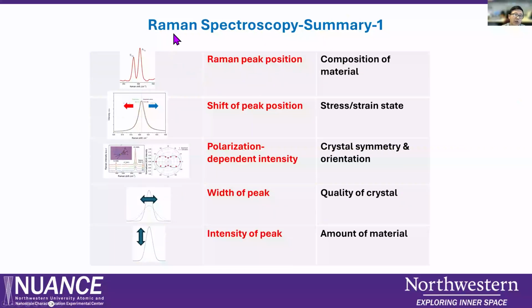Also, a summary about the Raman spectrum. Based on the peaks, the peak position tells you the composition of the material. Based on the peak shift, you will understand whether the material has stress.